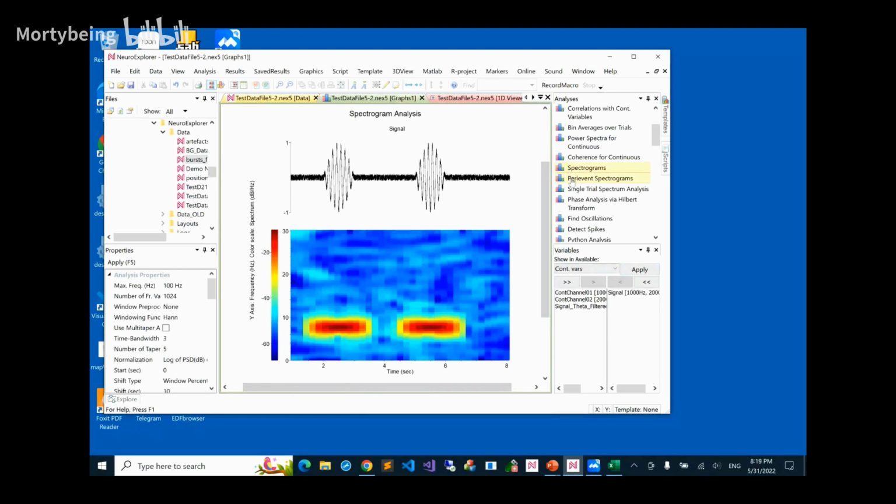So, for example, you have a stimulation and your continuous signal has a little bit of oscillation after each stimulus. But if you just analyze each after-stimulus period, you don't see much. I mean, it's very subtle.